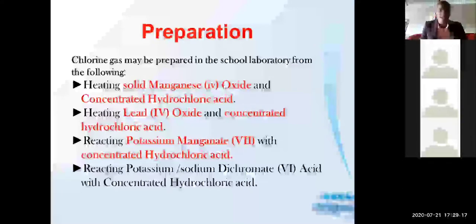So what I was saying is that when we are preparing chlorine gas by using solid manganese oxide and concentrated hydrochloric acid, there must be presence of heat.